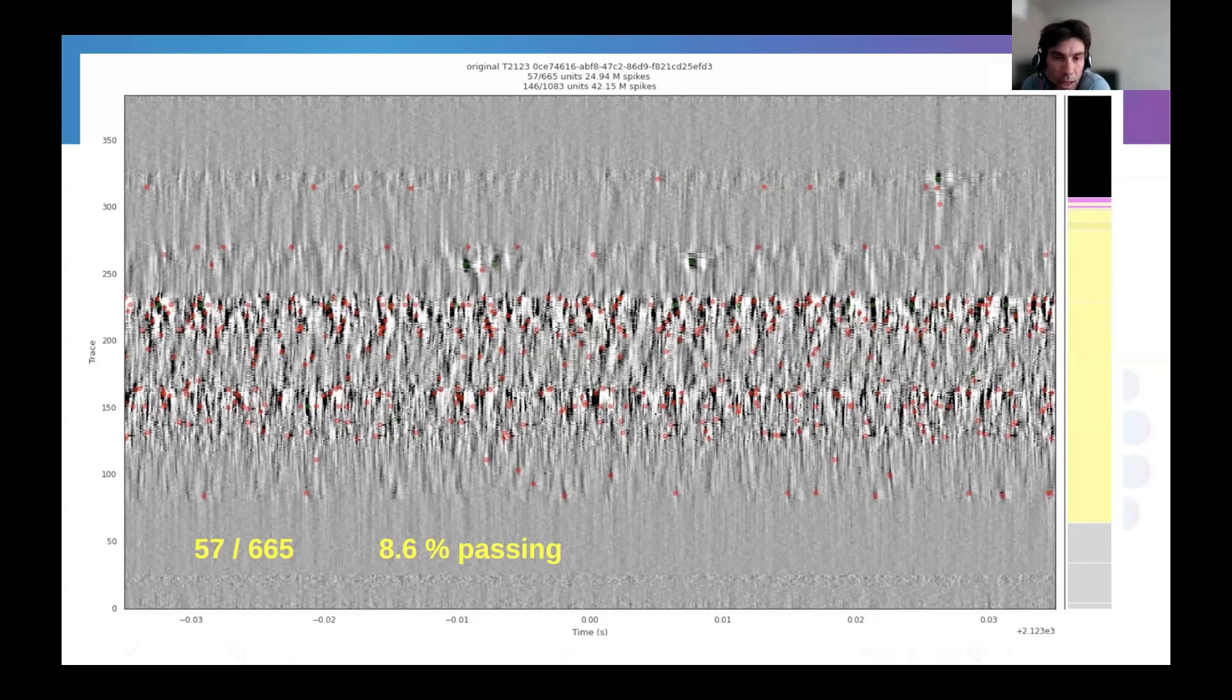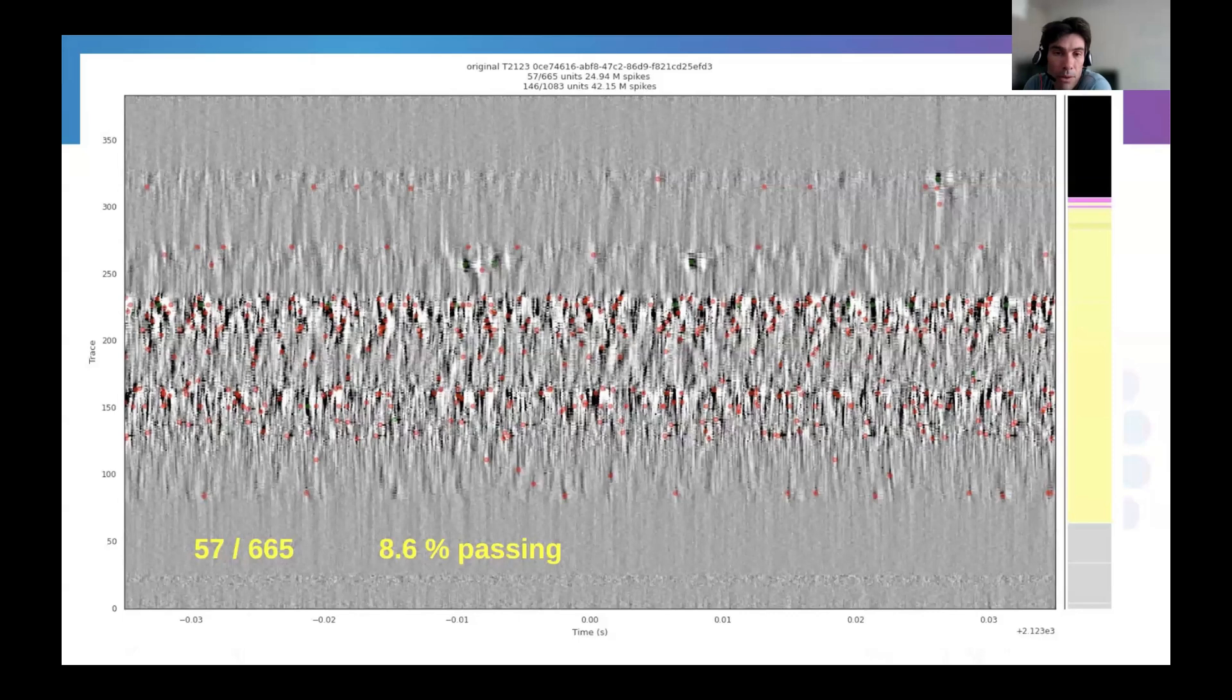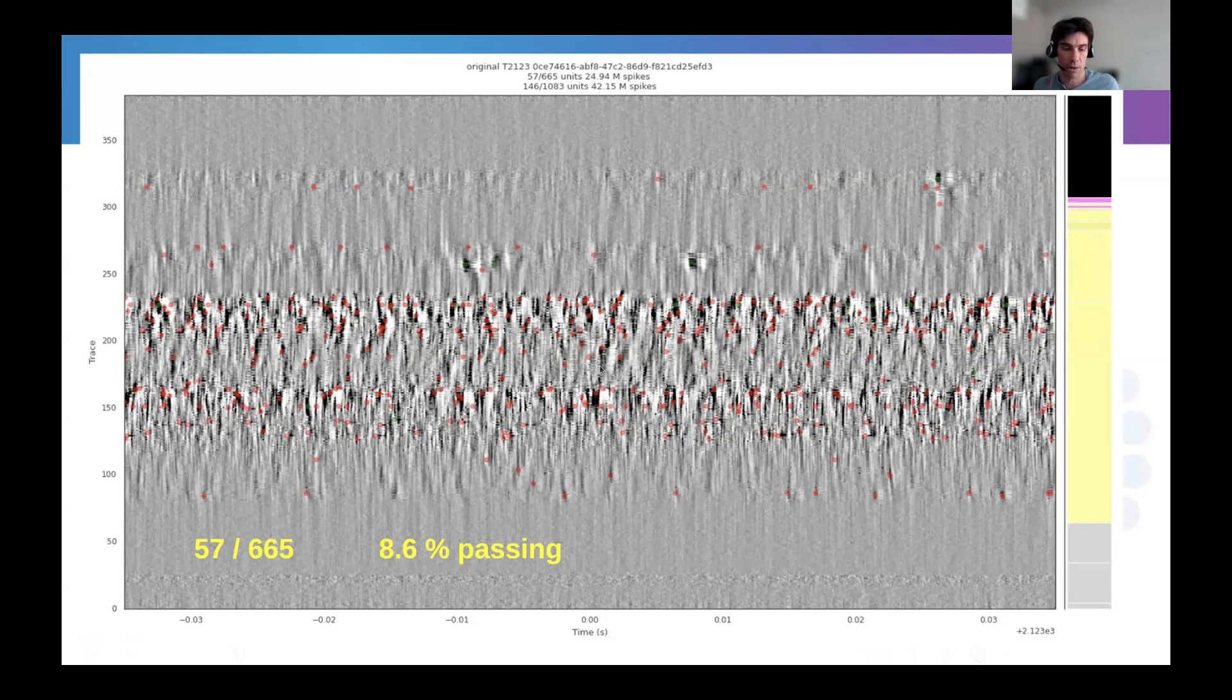Another thing that we changed is the default detection threshold. So here I'm showing an example of a spike sorting with our quality control matrix. We have only 8% of units passing. They are shown in green, while the spikes belonging to units that don't pass the quality control are in red. There are two ways to think about this thresholding. It's the amplitude, what is the minimal amplitude of a spike that needs to have in order to go through the spike sorting algorithm. If we lower too much the threshold, we get too much garbage into our spike sorter and the spike sorter cannot do its job.